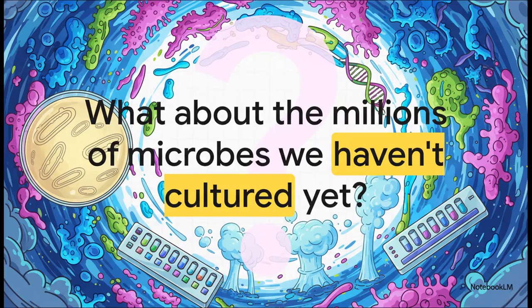So from a simple agar plate all the way to these rapid multi-test systems, we have developed some incredibly powerful tools to catch and name these microbial culprits. But this leaves us with a really fascinating final question. These techniques are amazing for the microbes we already know how to grow. But scientists estimate that we've only successfully cultured a tiny, tiny fraction of all the bacteria that exist on Earth. The great microbial mystery is far from over.